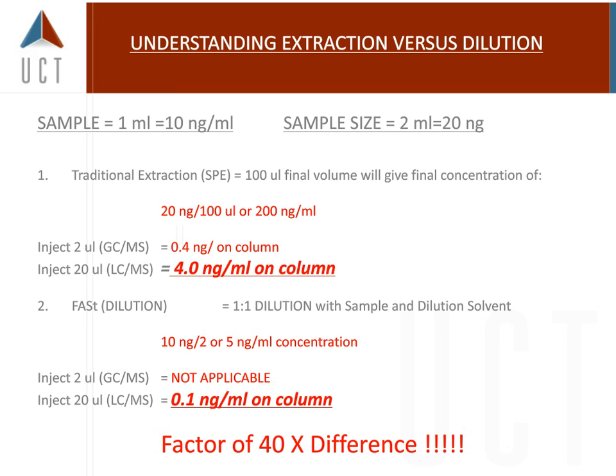I've seen many times where just doubling your sample size from a half a mil to 1 mil does not change anything in the solid phase procedure. It doesn't change anything maybe in the column you're using, but it automatically gives you 2 times more of that analyte which you're putting on the column to extract. In addition to that, when we reconstitute a sample, how much do we reconstitute it back? If we're doing GCMS, we're usually only injecting 1 or 2 microliters. So at that point, taking it back up in 25 or 50 microliters, that again is a factor of 2.